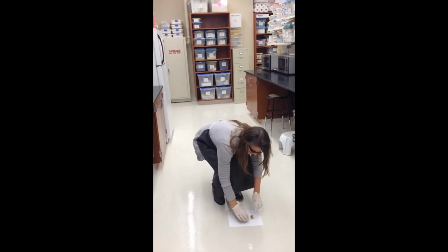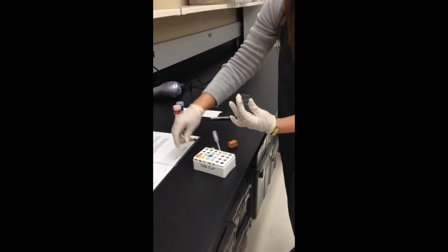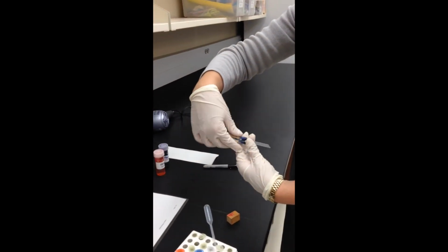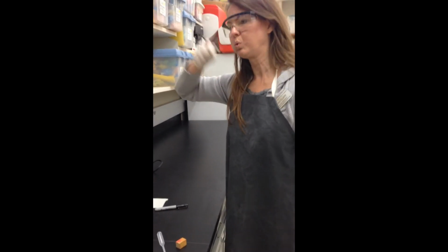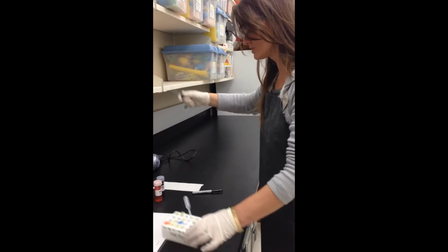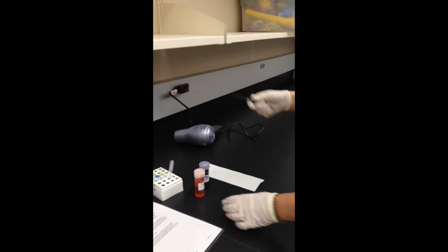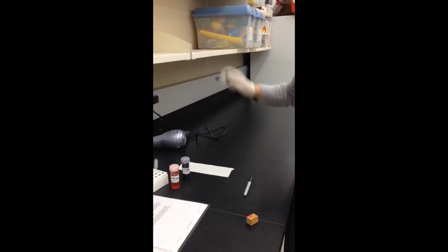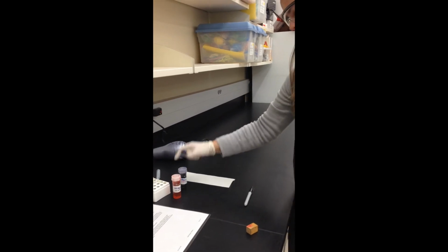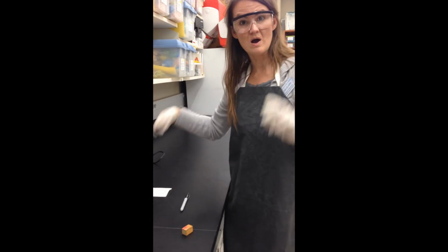Okay, so you're going to take your slide and you'll need to dry it. You may want to hold it with the clothespin, wave it through the air. You're going to let that air dry, and you can go ahead and be looking at what you're going to be doing next. What you'll do next is you're going to dip your slide into your first stain for 1 second, and then dip it into your stain 2 for 1 second. You'll repeat both of those twice.